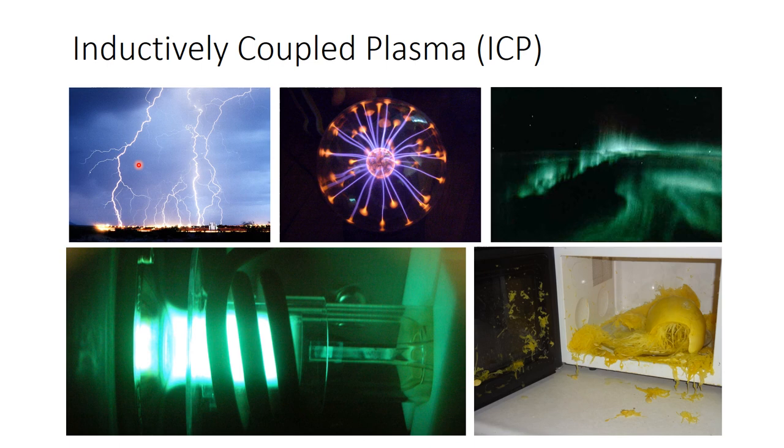But in our mass spectrometer source, we have this thing called an inductively coupled plasma. And this is usually, although not always, an argon plasma. So we basically have a flow of argon gas that comes down this glass tube. And then there's this metal coil here through which an alternating current is passed, which creates a very strong alternating electromagnetic field. Okay, and this is at radio frequency. And this works in a very similar way to a microwave.